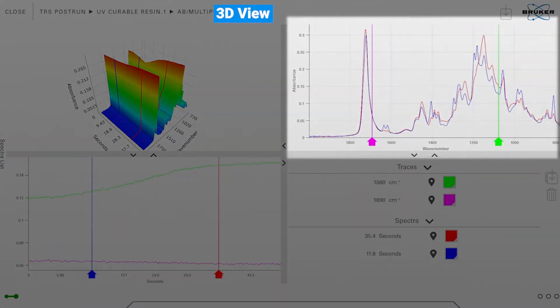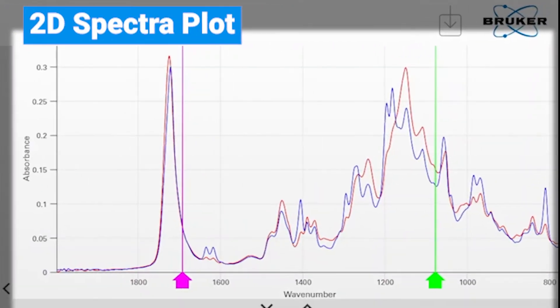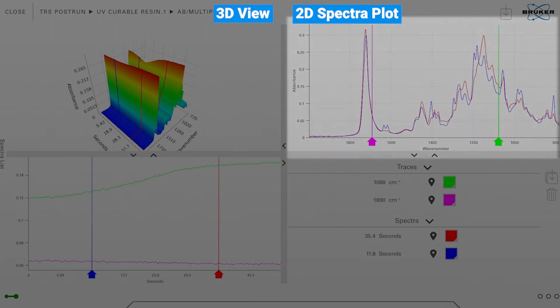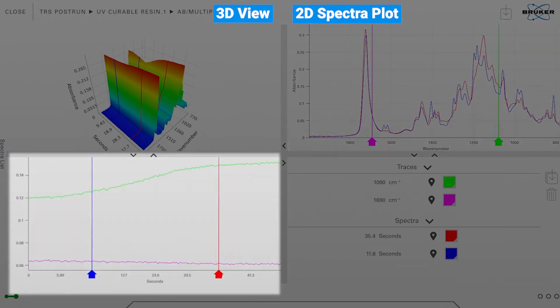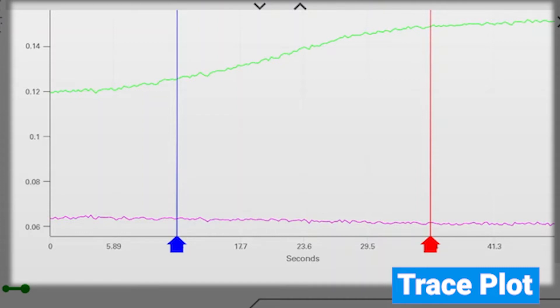On the upper right corner you can see 2D spectra which represent the 2D spectra at the position of the blue and red marker which you can see on the lower left corner. The blue and red markers in the lower left corner represent the 2D spectra at a certain time value and the information in this window, so the green and magenta colored lines here.